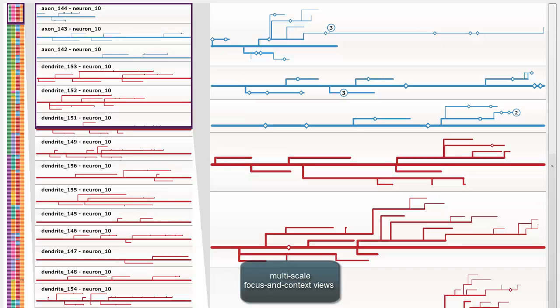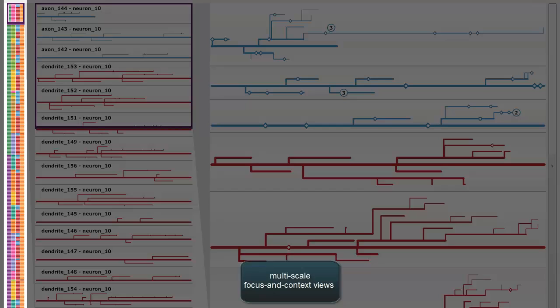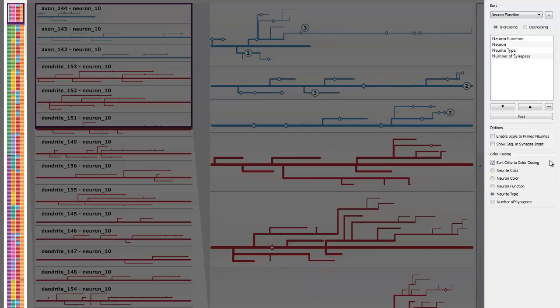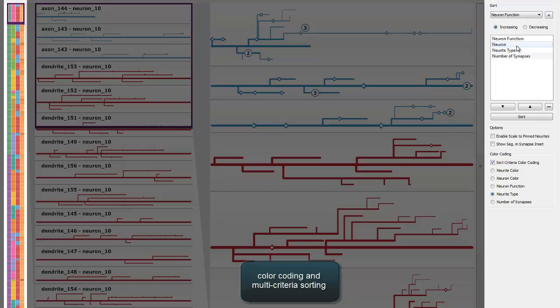The first view is the navigation bar, where each line represents a single neurite. Neurites are color-coded and display either one or several user-chosen neurite parameters or show the original segmentation color.